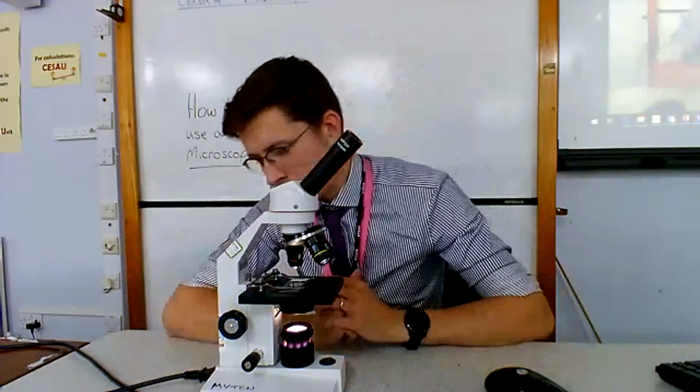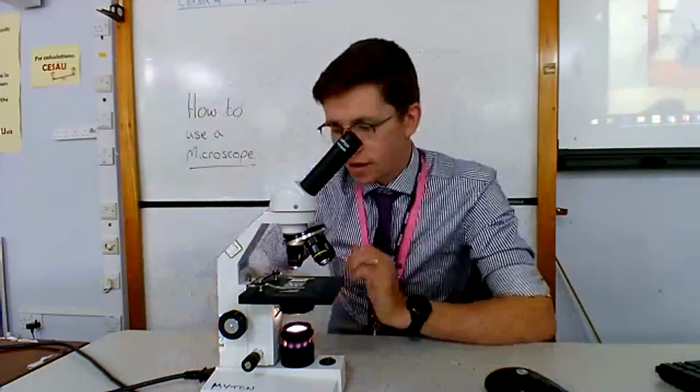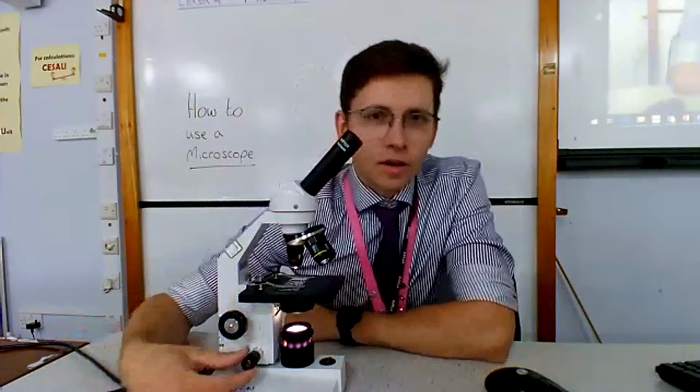Now the last two parts of this microscope that we should have left to label are some focusing wheels. Okay, so we have firstly a coarse focusing wheel, and you'll see when I move it, it moves really quickly. Okay, so this is like a rough focus that we can spin, and then underneath it is called a fine focusing wheel.